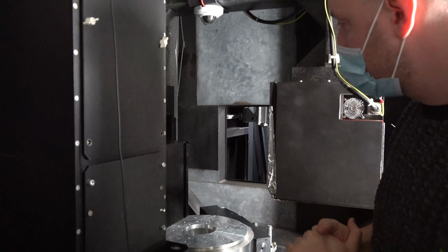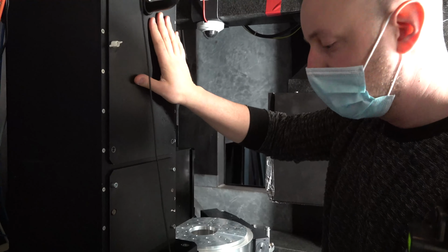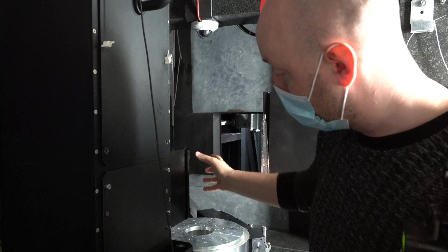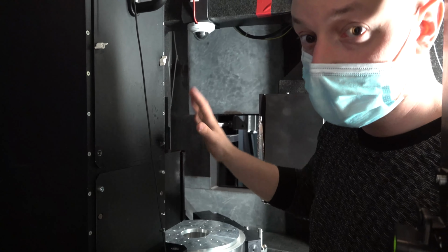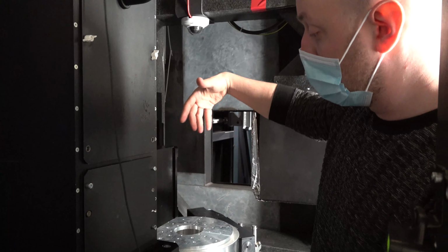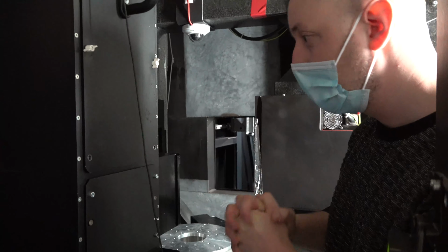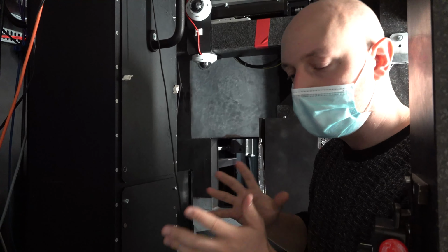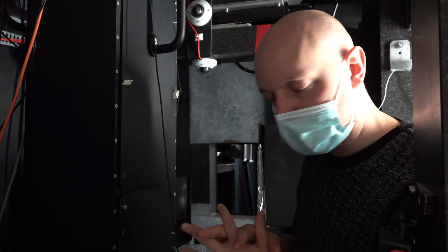Now, to the instruments. Let's start with the neutron part. The neutrons are coming down this way. This is one of our several neutron detectors for different resolutions, and essentially the neutron will come down this way, will interact with the sample, and will be captured by this, which will transform the neutrons into visible light, which we can then capture with cameras. This is the rotation stage, which will allow you to take projections at different angles and then eventually to back project to a 3D volume. This is for relatively large fields of view, up to about 20 centimeters down to resolutions about 20 microns, but we have other detectors that can push the resolution all the way down to about 3-4 microns.